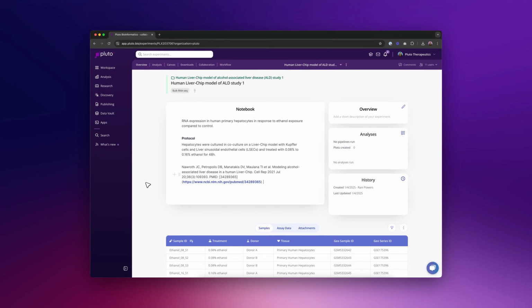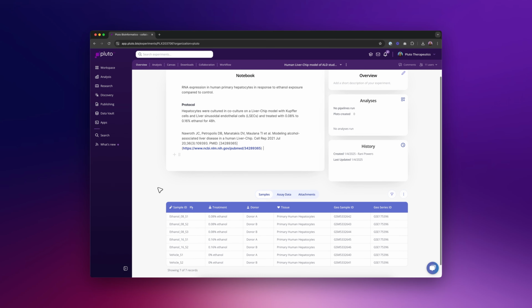Hey there, this video is going to cover a pretty common recipe, which is multi-condition comparisons, especially when looking at bulk RNA-seq or other kinds of omics datasets. So we'll be using this bulk RNA-seq dataset as an example that we'll be walking through.